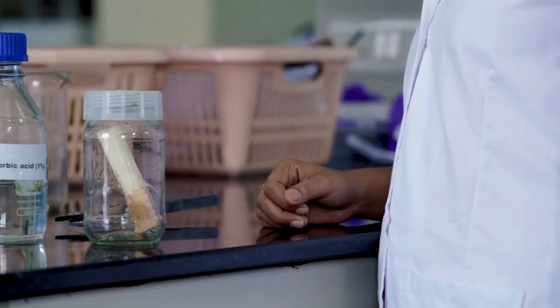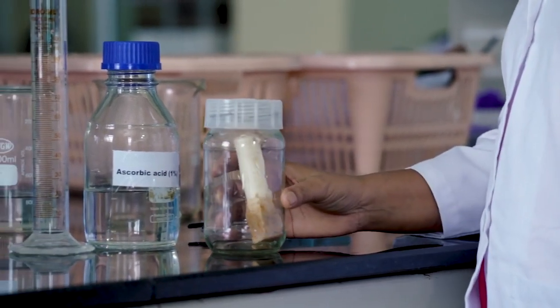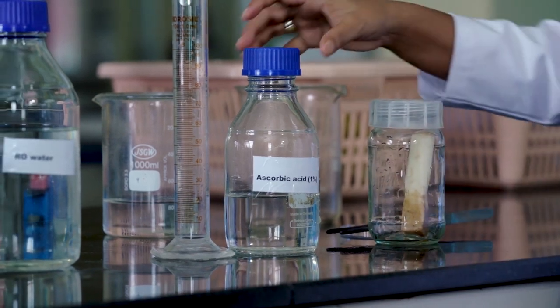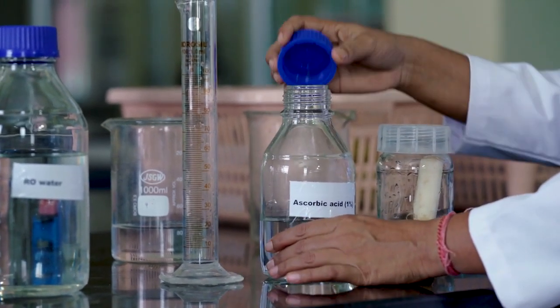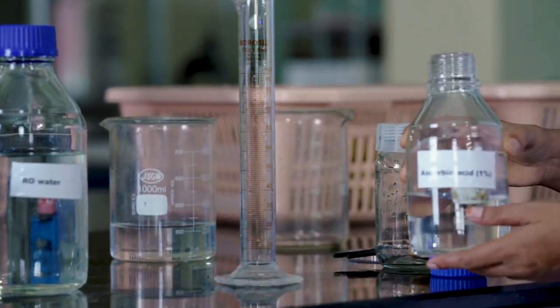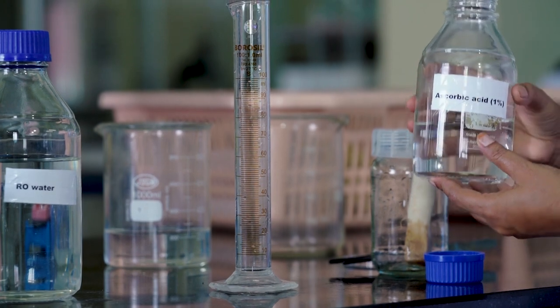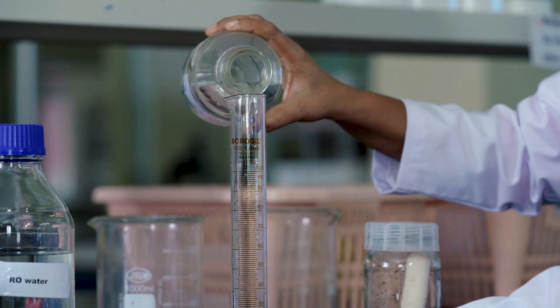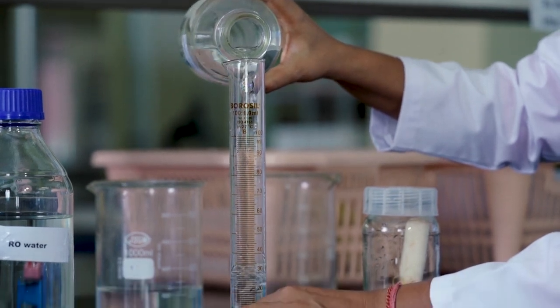To carry out the practical on micropropagation of banana, I will take the help of our technical assistants, Sukurmani, Indrani and Sarika. Now we'll take the explant in a glass jar. As you can see, the explant's lower portion has turned brownish in color, because banana contains a high amount of polyphenols. To reduce the concentration of polyphenols in the explants, we will be treating with ascorbic acid solution. So here we will be taking 1% ascorbic acid solution.